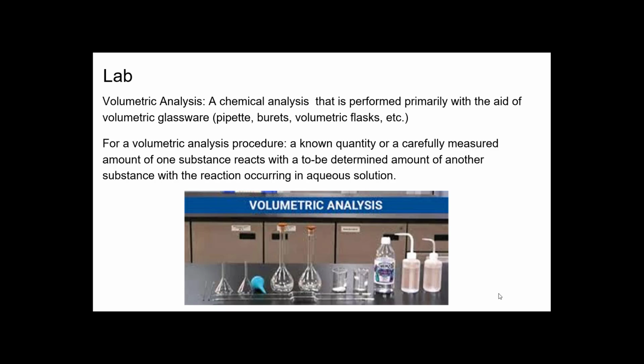We try to keep this as accurate and precise as possible to remove a lot of errors that would be done otherwise, because we are trying to determine, in most cases, a concentration of an unknown. We have the volume, but we don't know what the concentration is, so we want to get that as accurate as we can.